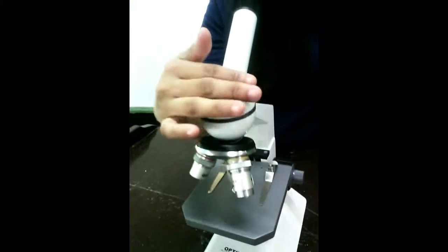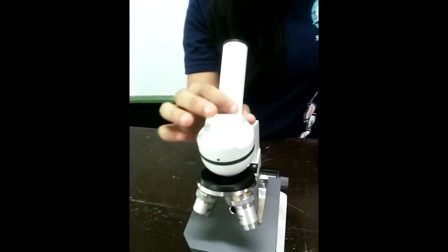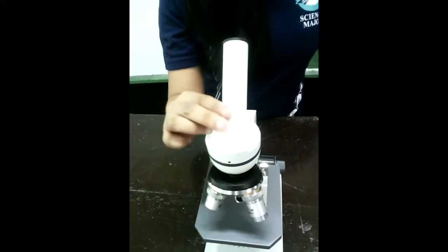The draw tube is the smaller cylinder attached to the upper part of the body tube that holds the ocular.